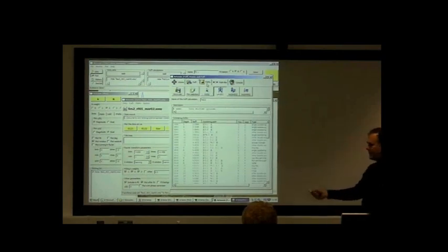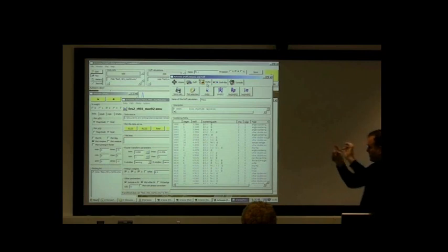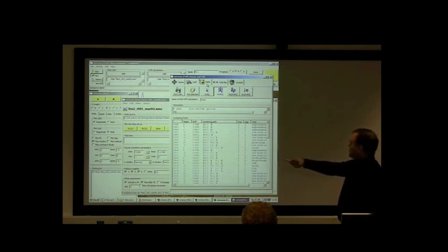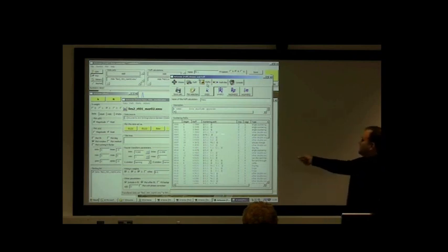That is the kind of path that leaves the iron and scatters just off of the sulfur atom and then closes the loop. And there's 6 of them at the first distance, 6 of them at the second distance, and 2 of them at this other distance. There's then something else, and then there's another single scattering path.